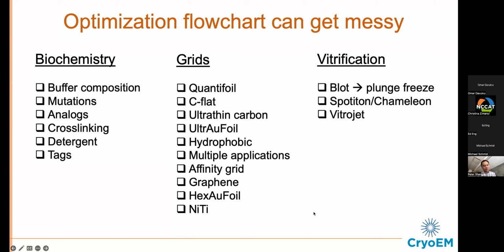First question here: I have a small related problem. I purified a protein. SEC looks good, but on negative stain, the protein is aggregating and forming different sizes or shapes. Suggestions on how to deal with it? I think this is the type of question to punt to the experts at the national centers, right?